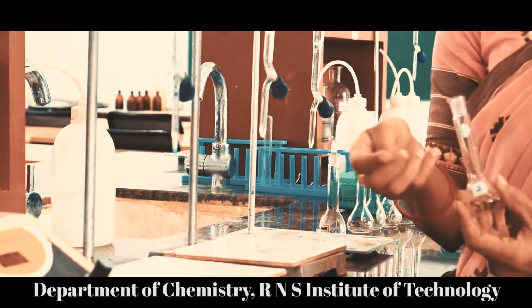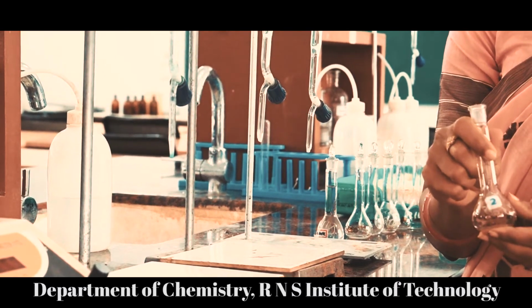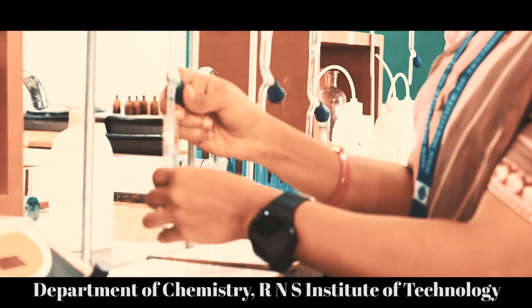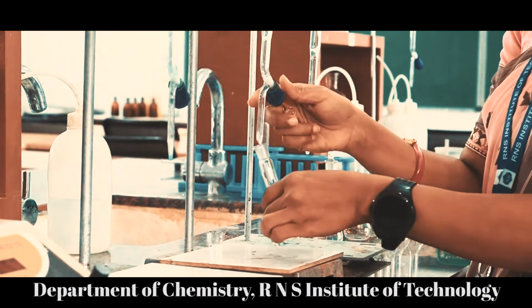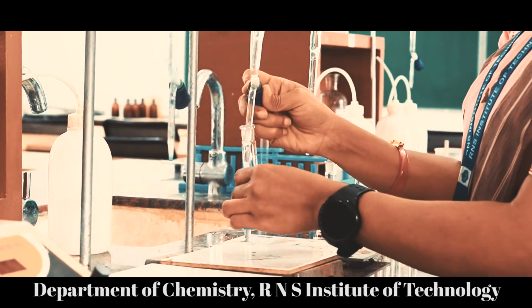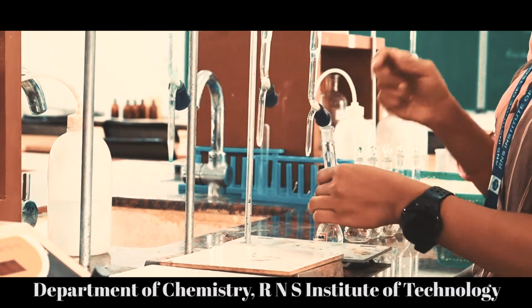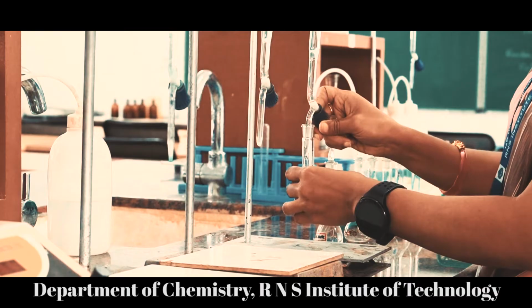We are going with flask number 2. We are adding 2 ml of copper sulfate to flask number 2, then 2.5 ml ammonium hydroxide, and dilute the solution with distilled water up to the mark.